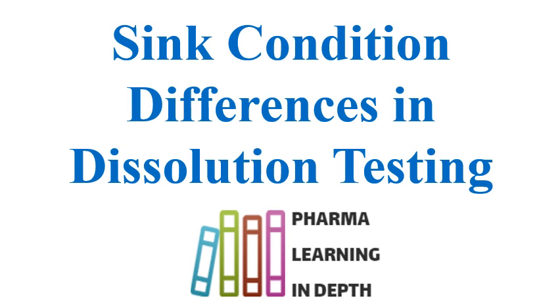So you can adjust the volume, and you can also adjust the dissolution specifications.